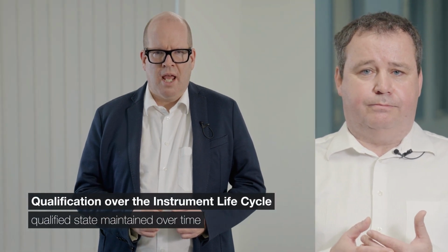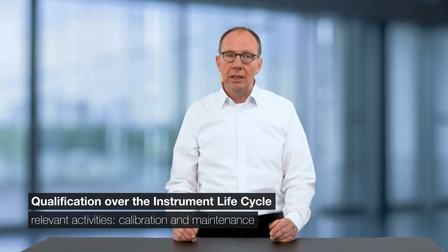And Georg, what is needed to keep an instrument qualified over the entire instrument lifecycle? Qualification is not a one-off process, but plays a role over the entire life cycle of the device. This means the instrument must be kept in a qualified condition. Axel, I know you have a big focus on balances. How is it done? Balances can be held in a qualified state by regular maintenance and calibration, where it is shown that the instrument works properly and within its tolerance limits.